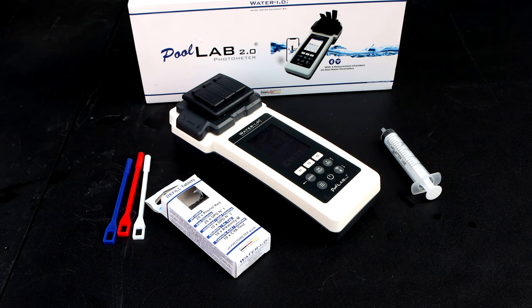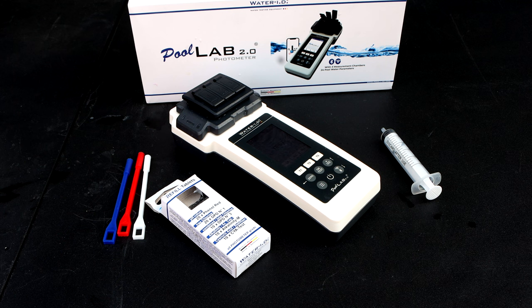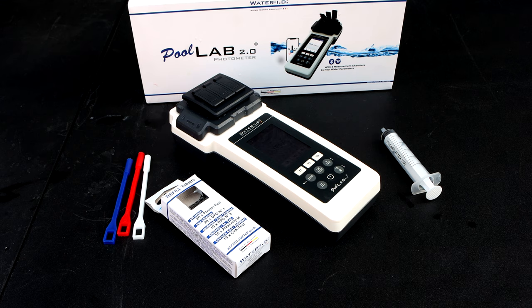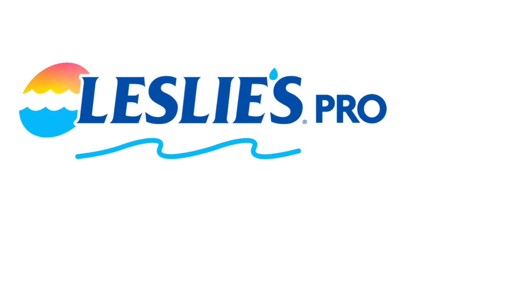If you're in the market for a good photometer, I think the Pool Lab 2.0 or Water Tester would be a great photometer for you. It does three test factors at once which will speed up your testing. It also does 24 different test factors and I really like the screen and how it displays the results and how fast it is to do the testing.